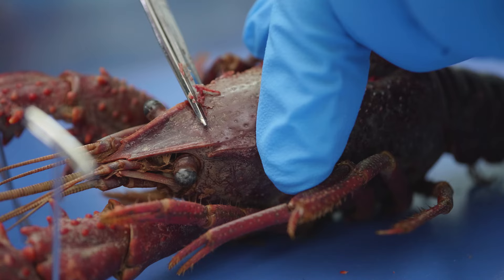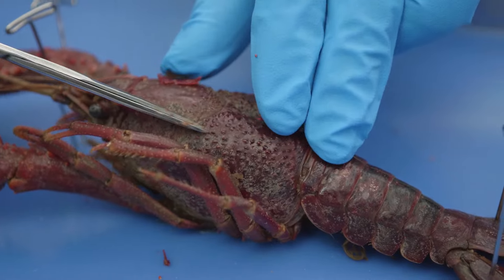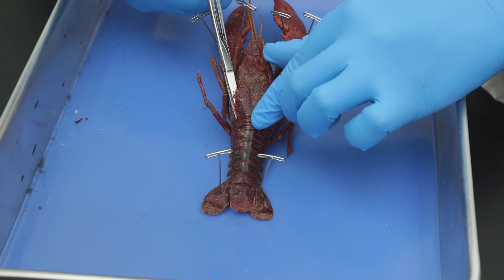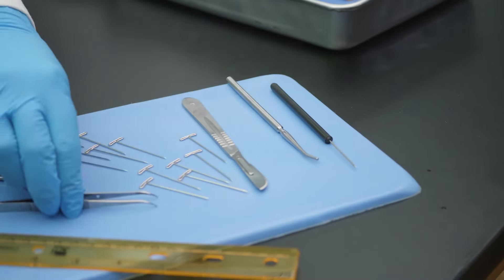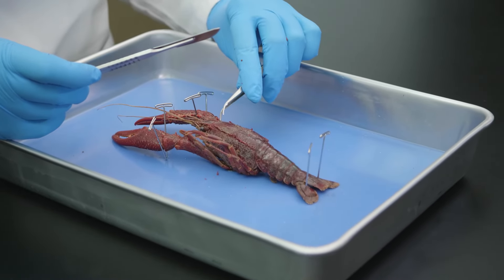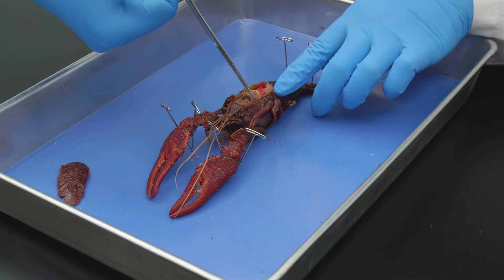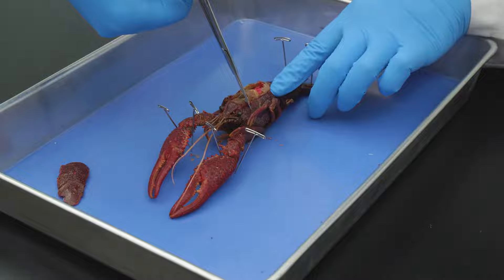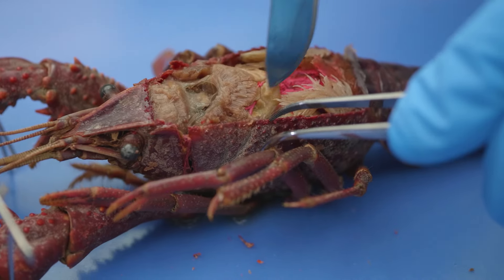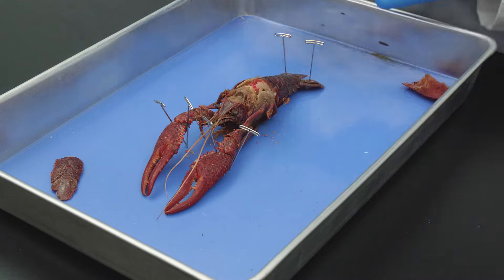Next, we make a transverse incision across the rostrum just behind the eyes. Then we make another incision back down the opposite side of the carapace to the posterior end of the carapace. Some of the crayfish's internal organs may be stuck to the carapace, so we need to gently scrape them loose while lifting up the incised portion. From the medial incision we made earlier, we cut along the cervical groove to the bottom of the carapace. Then we carefully remove the carapace and repeat the procedure on the opposite side.